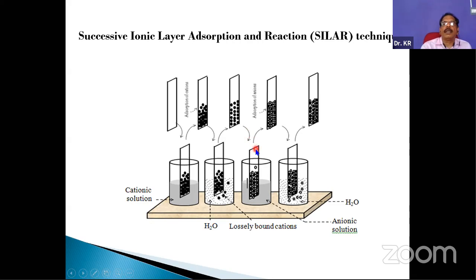Then the substrate is dipped in the anionic solution, where the S2- ions are picked up by the substrate. They are picked up due to the positive ion nature of Cd cadmium ions. Then it is dipped, immersed in another water bath, which removes the loosely bound CdS compound molecules. These four dippings constitute one cycle. We can continue the cycle repeatedly until the required thickness is reached. Therefore, the number of dippings determines the thickness of the films along with several other process parameters.